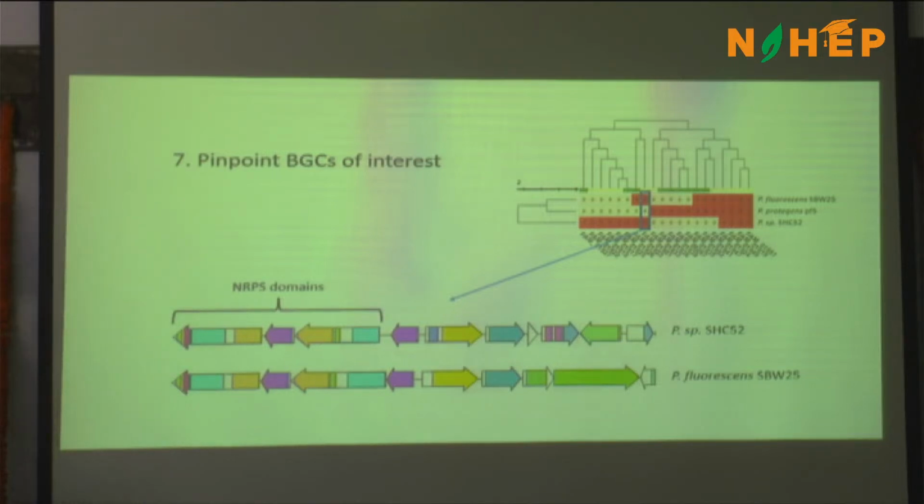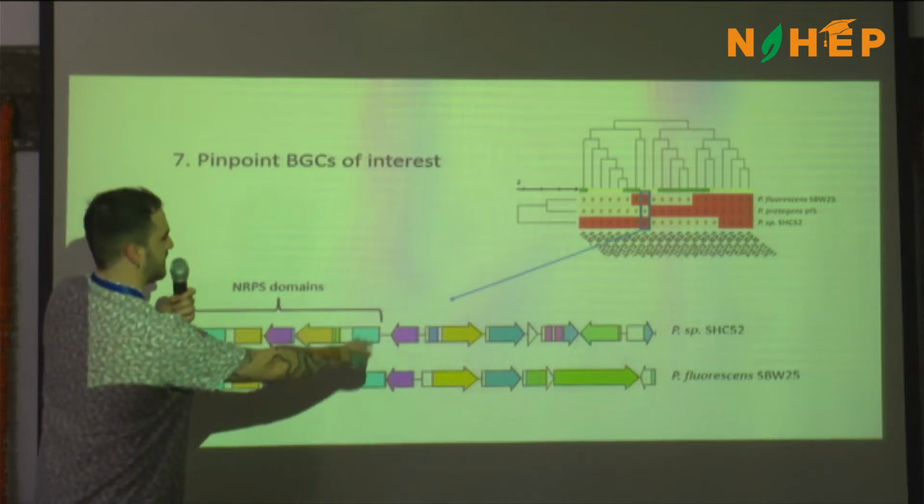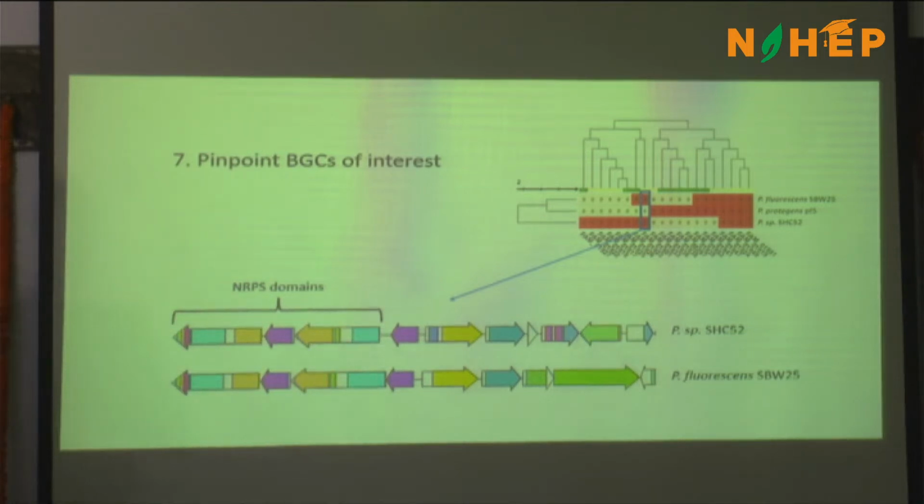We see the BGC chain, where each arrow is a gene, and we see that it's present in our 2 bacteria with an antagonist phenotype, right? Some regions are almost the same, we see them here and also there, but other regions are slightly different. But in overview, it looks really similar, right? And we know that it's an NRPS domain because the program tells you there is an NRPS here, a non-ribosomal peptide synthetase, okay?